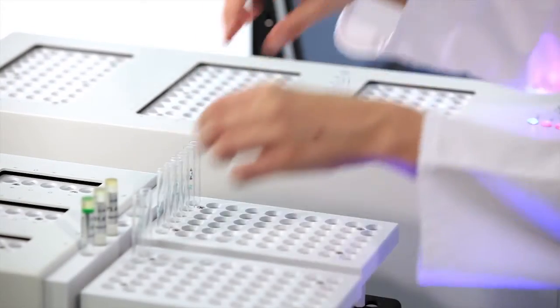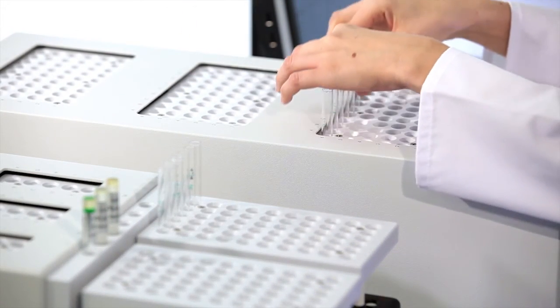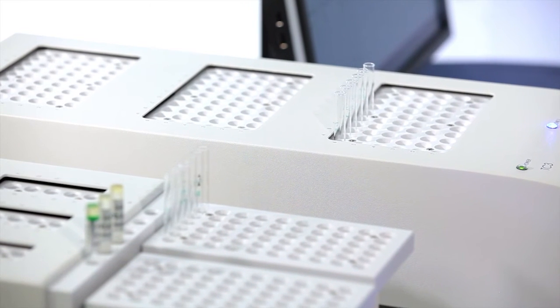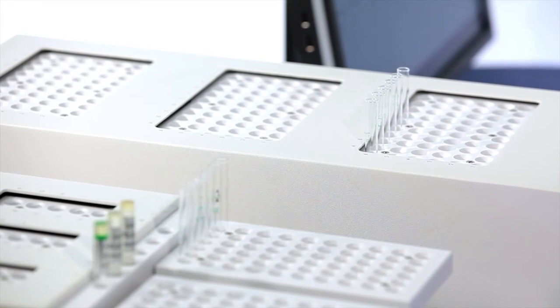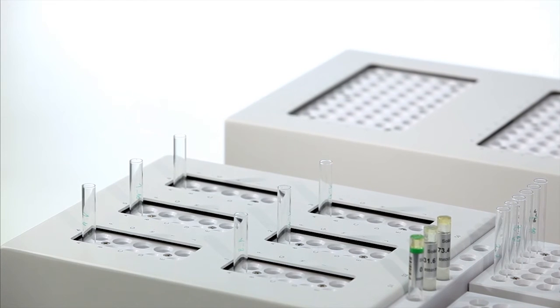Many tempering steps with precise temperatures and time intervals have to be performed prior to NMR measurement. For this purpose, Bruker supplies three large Peltier baths for pre-tempering and six smaller baths for the respective measuring temperatures.